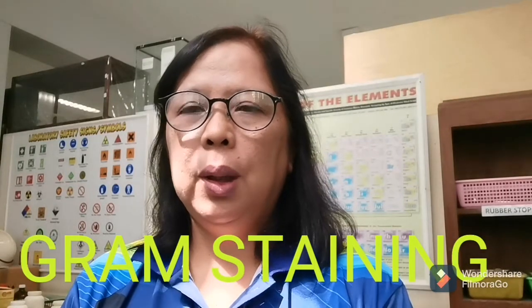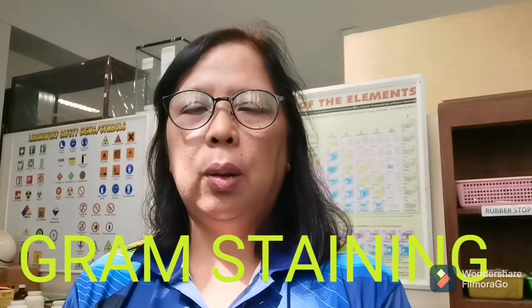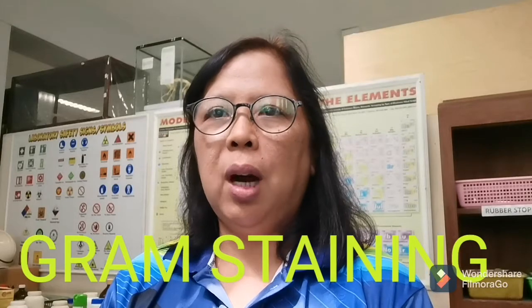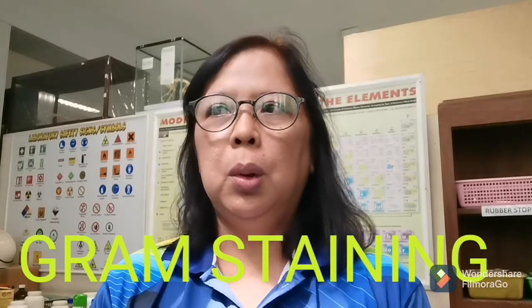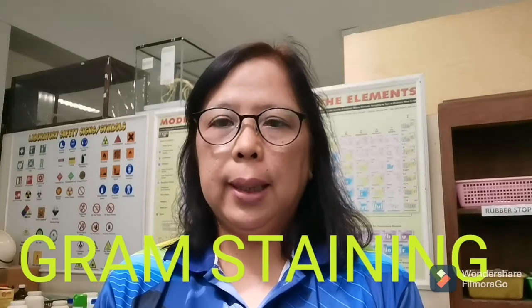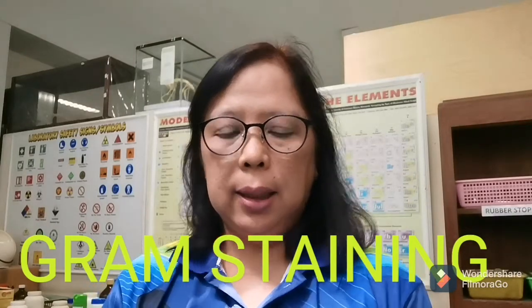Nice to be with you in the microbiology laboratory. In this session, I will be performing for you a very important microbial analysis, that is staining.